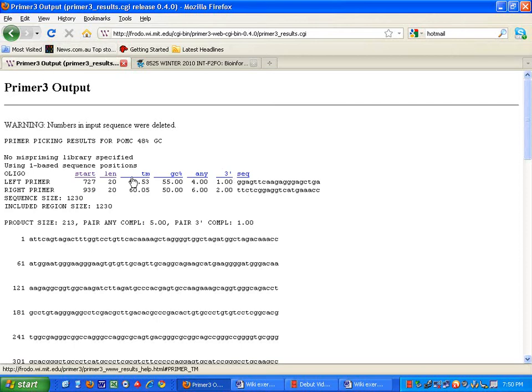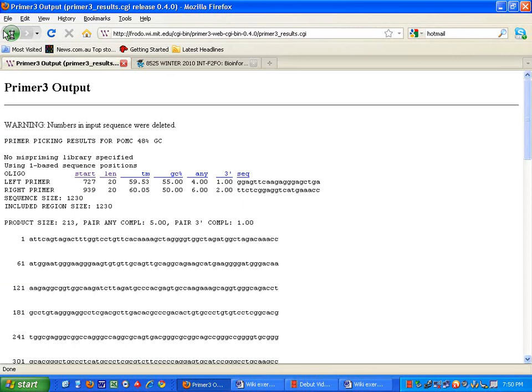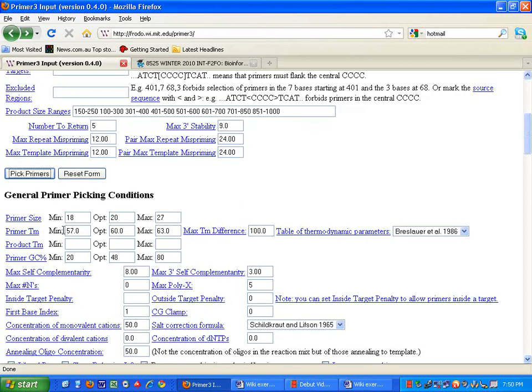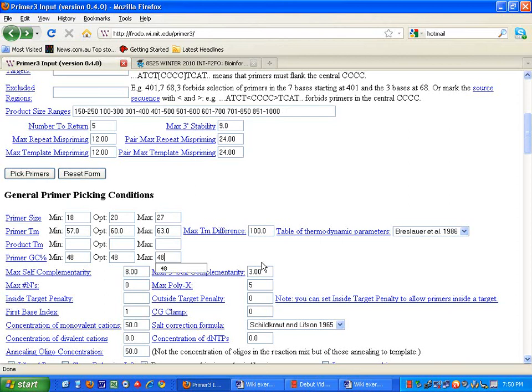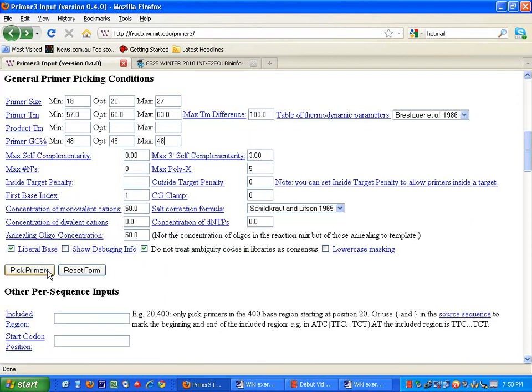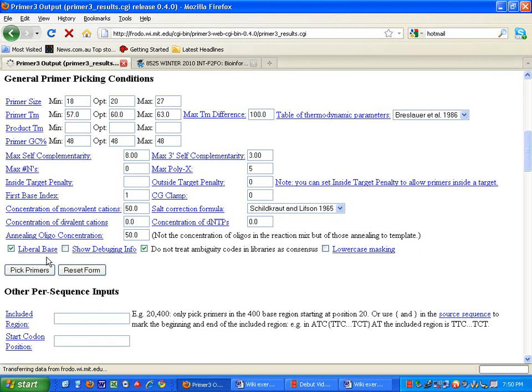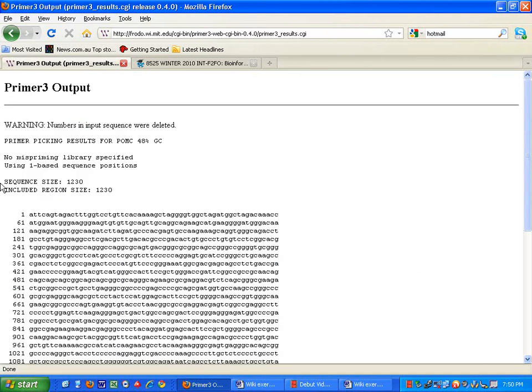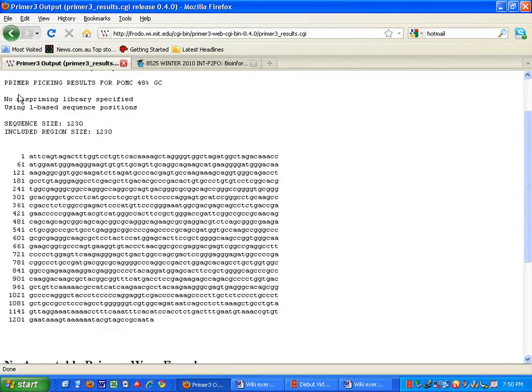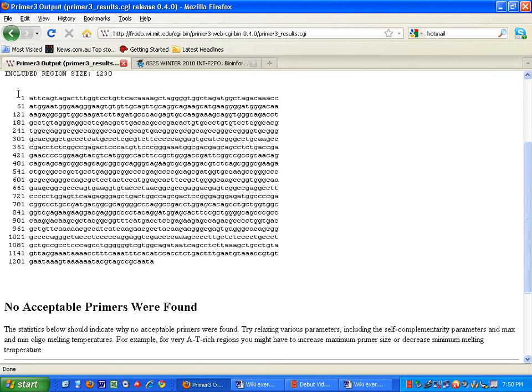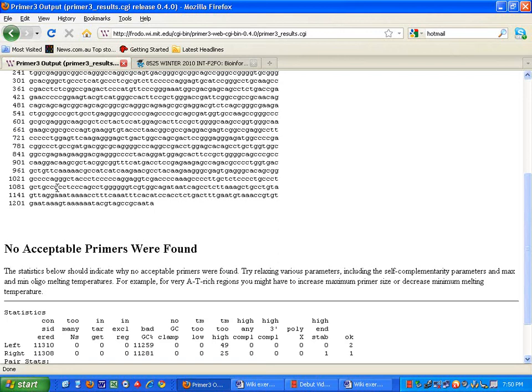If you are very quick to notice, those are actually the same primers generated simply by leaving the defaults there. Therefore, by simply putting in an optimal GC percentage that we want to drive towards is not sufficient enough. Therefore, we must change the minimum and maximums to what we are looking for. So we drive it there, and there are no sequences, and there are no primers suitable.